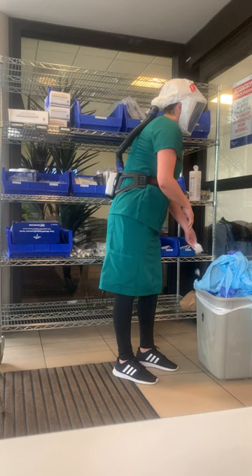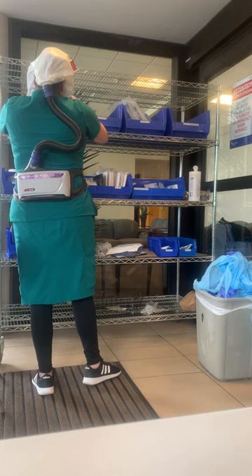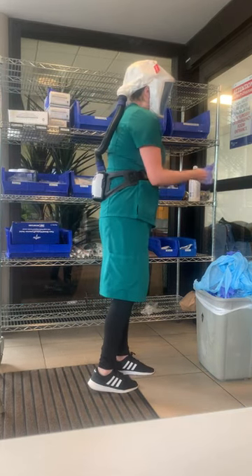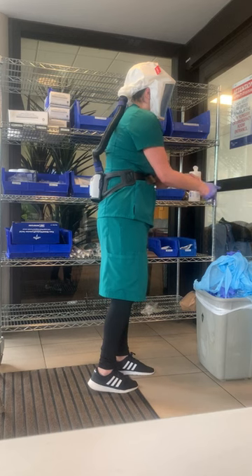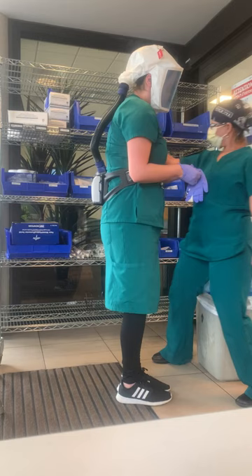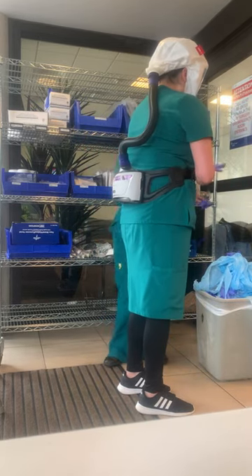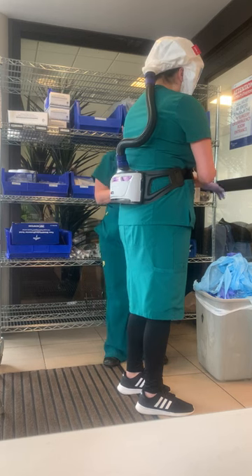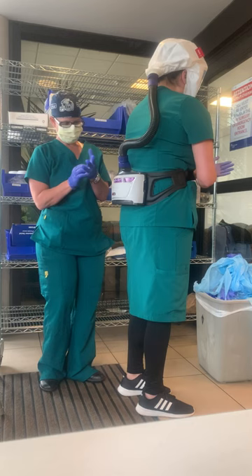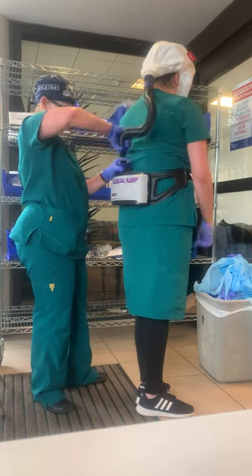Don gloves. Have PPE helper turn off the motor blower, and remove the headpiece and motor blower belt.